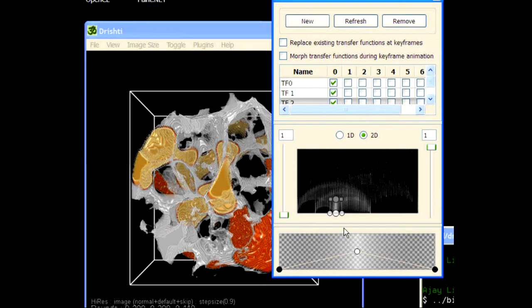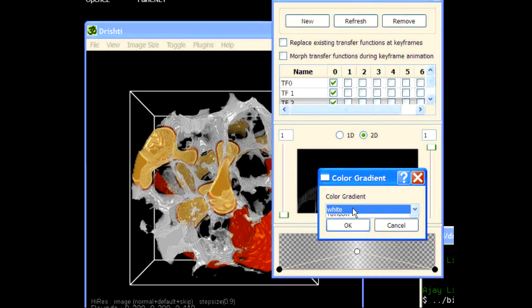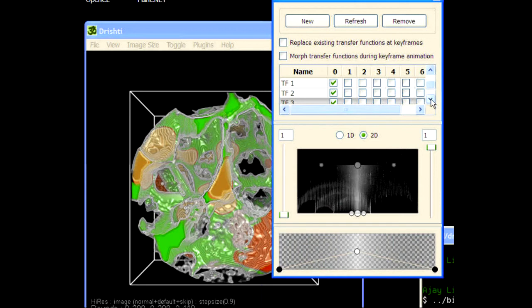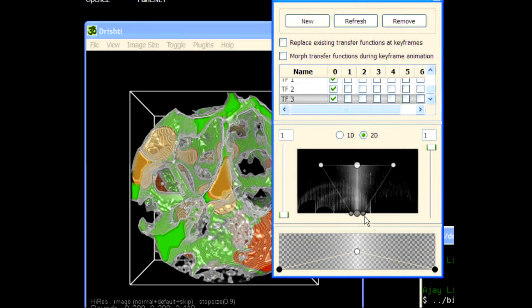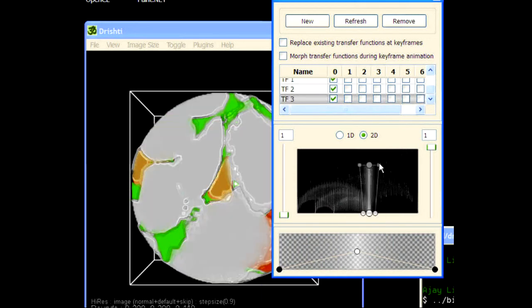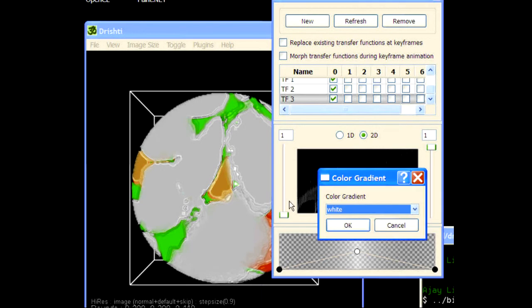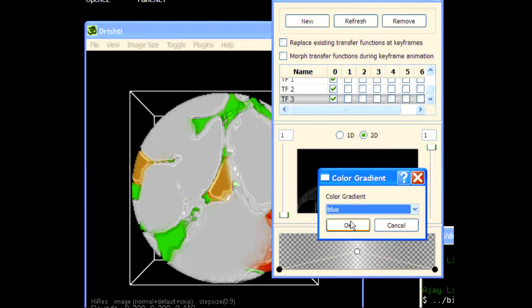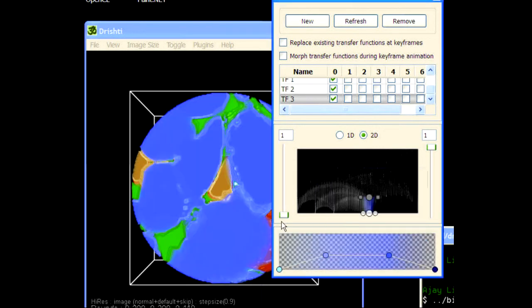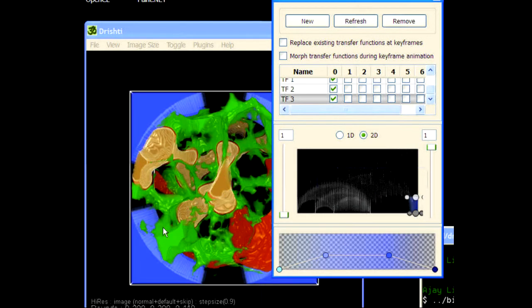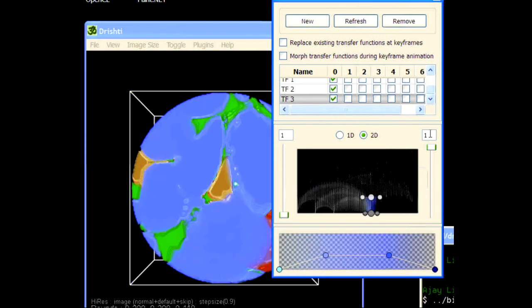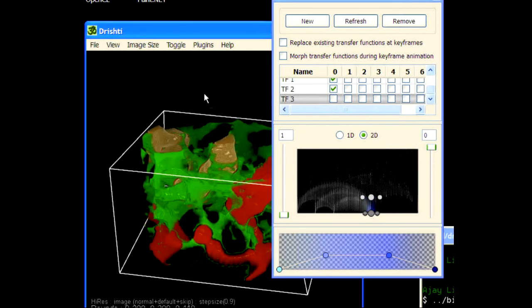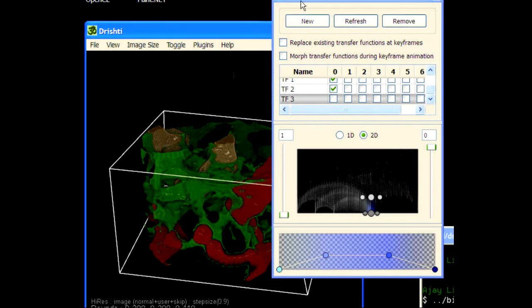And yet another one, this one here. Let's call it say blue, and so on. And this is your fiducio, so this one here, and you can also set 0.